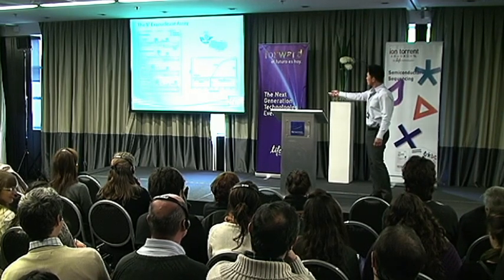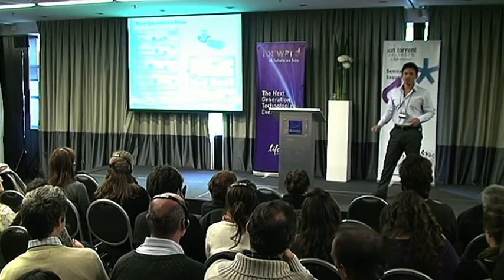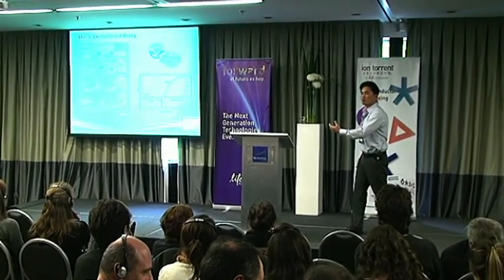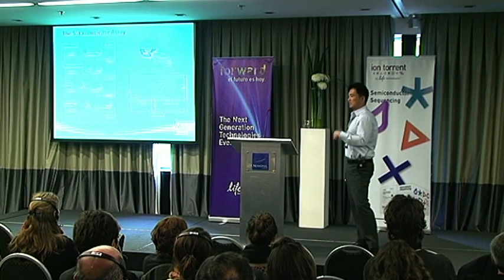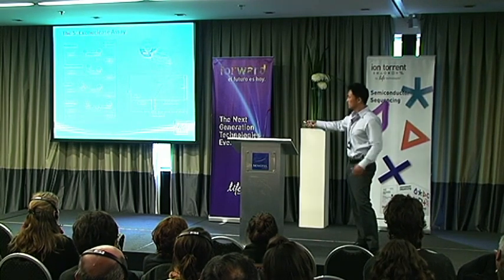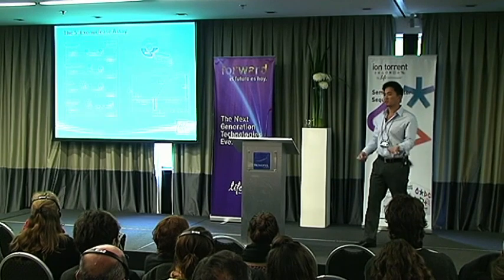So if we start with the forward primer over here, and then the polymerase is moving and encounters the TaqMan probe, which is a short oligonucleotide, has a fluorescent label on the 5' end, and has a quencher molecule on the 3' end. As the polymerase encounters that probe, it just simply digests it. And so when I digest that probe, we liberate fluorescence. This fluorescence that you see that's liberated in solution is separated away from the quencher, and then what happens is we get a rise in fluorescence level.